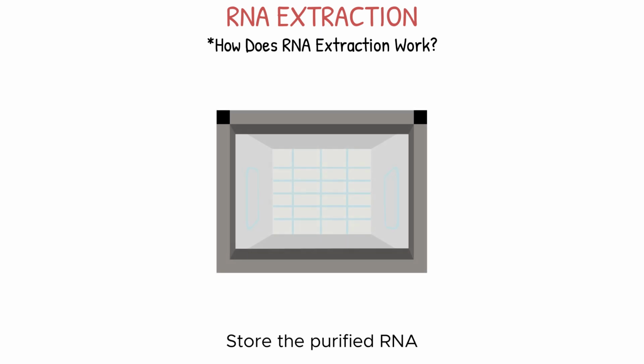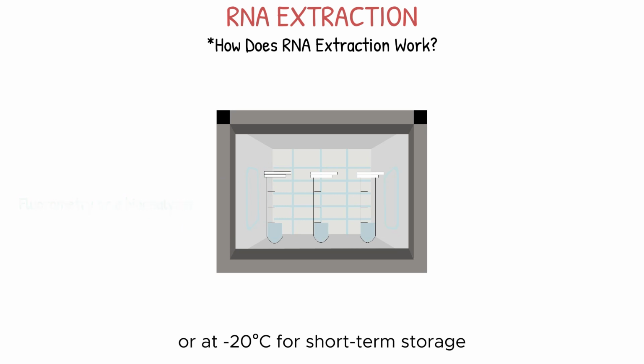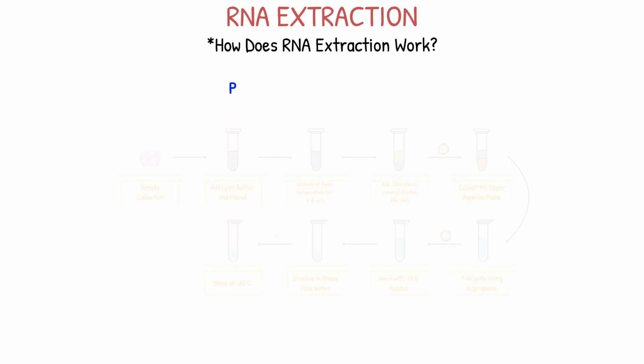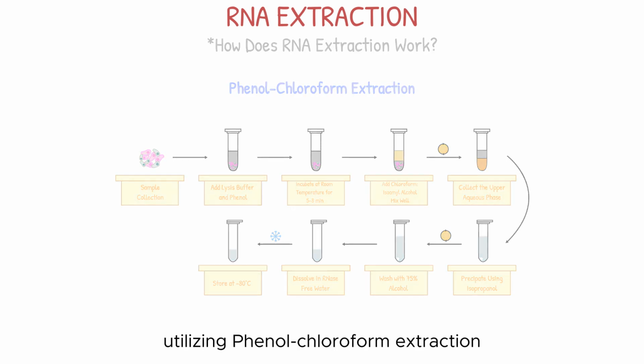Store the purified RNA at -80 degrees Celsius for long-term storage or at -20 degrees Celsius for short-term storage to maintain RNA integrity and prevent degradation. The following is a schematic diagram of the complete RNA extraction process utilizing phenol chloroform extraction.